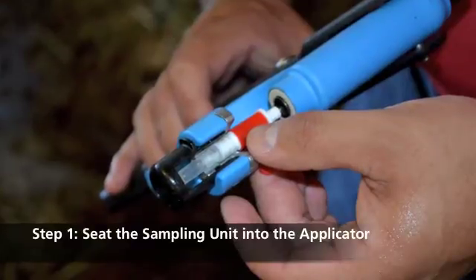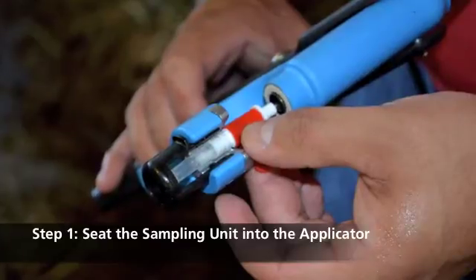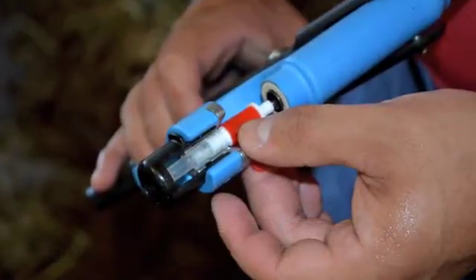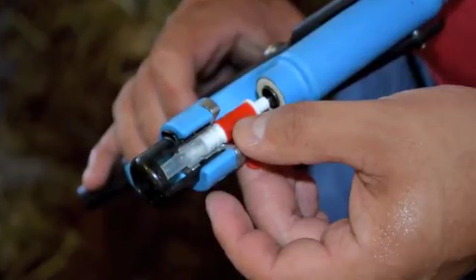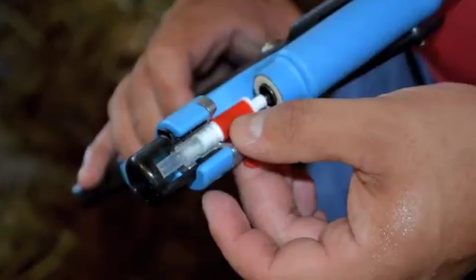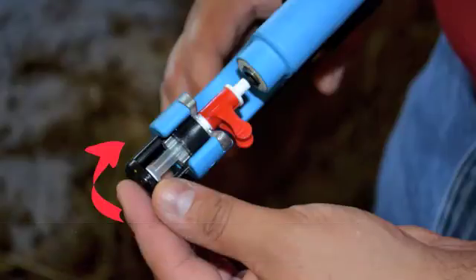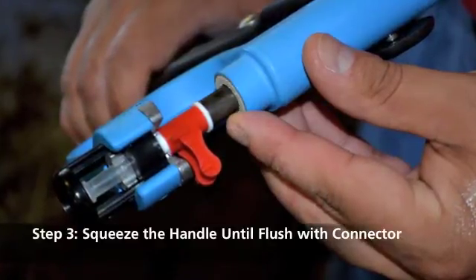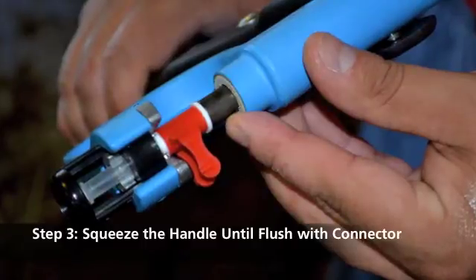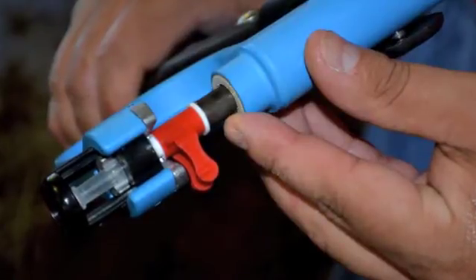Loading the applicator with the sampling unit is a quick and simple process. First, seat the sampling unit into the applicator as shown, using the built-in grooves on the applicator and unit to help align it properly. The sampling unit should be assembled as one piece — if it has come apart, reassemble before loading. Next, twist the black tube retainer clockwise until it secures the sampling unit into place. After the black tube retainer is in place, carefully squeeze the applicator handles together, guiding the hole in the gun bolt onto the top of the cutter piece if needed. When fully seated, the gun bolt will rest flush against the red plastic connector.